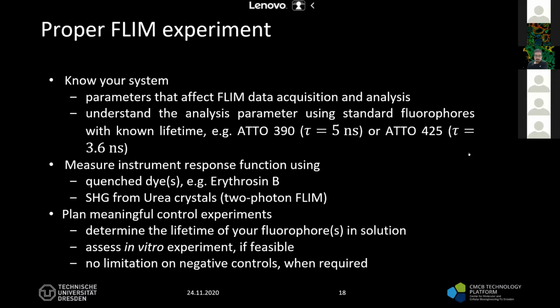Gerhard is saying that I'm afraid there are various definitions of these terms depending on whether you use time domain or frequency domain. Regarding frequency domain, I don't have experience. I really don't know the answer. What I said was just limited to the time domain. You're right, Gerhard.